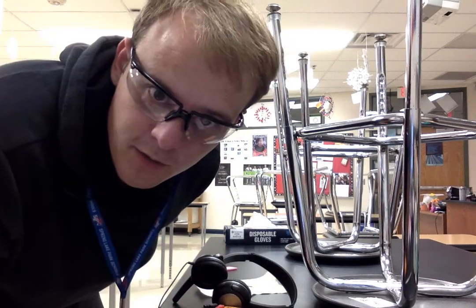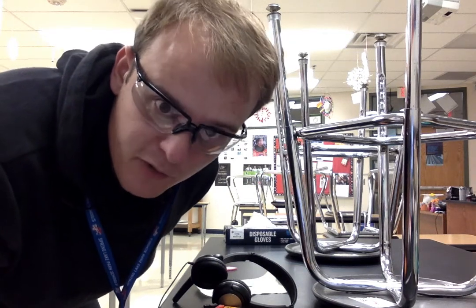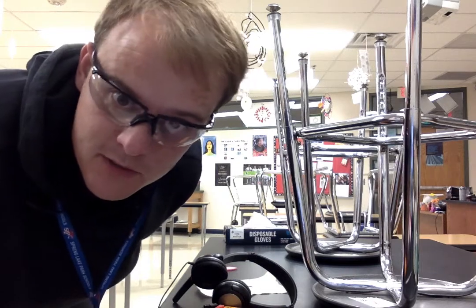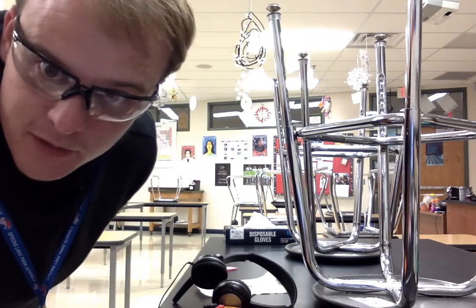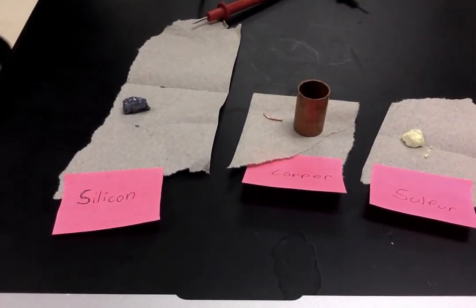Mr. Brunsvold here. So for this next lab, what we're going to be doing is looking at three different elements, and we're going to try to use the physical properties of those elements to determine whether each element is a metal, a nonmetal, or a metalloid. So let's take a look at our elements. We've got three of them right here. One of them is silicon, one of them is copper, one of them is sulfur. So go ahead and write down the name of each element on your lab sheet, and then write down what color you think each one is.